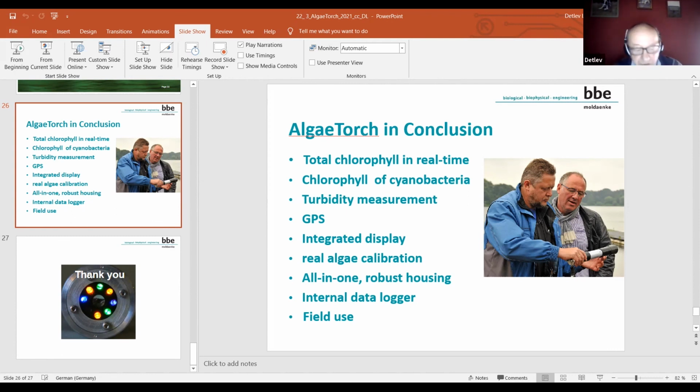Phaeophytin usually is not inside the spectrophotometric pattern of what we measure, because you have to imagine that we do not extract it. We measure the chlorophyll A fluorescence, and if you have phaeophytin inside of the algae, because it is decaying, then you cannot see this with a fluorometer.